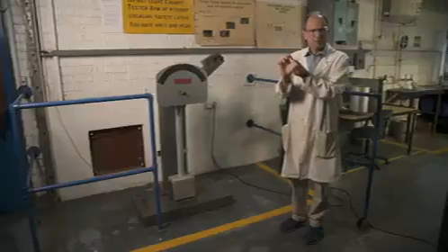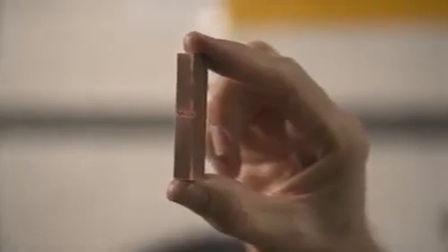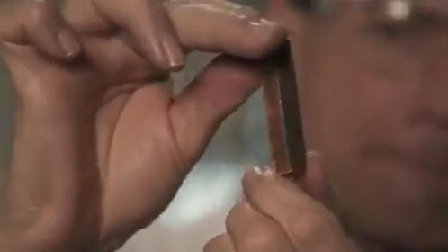Here we have a copper test piece. All test specimens are made to fixed dimensions. That's a requirement of the test. What you see is in length, it's 55 millimeters. In cross-section, 10 millimeters by 10 millimeters. At the center on one side is a notch. The notch is 2 millimeters deep, and it's set at an angle of 45 degrees. And the tip of the notch, the radius, is 0.25 millimeters, 250 microns.